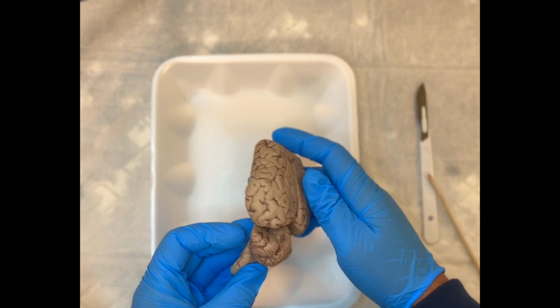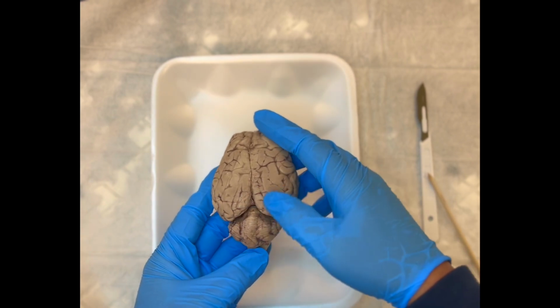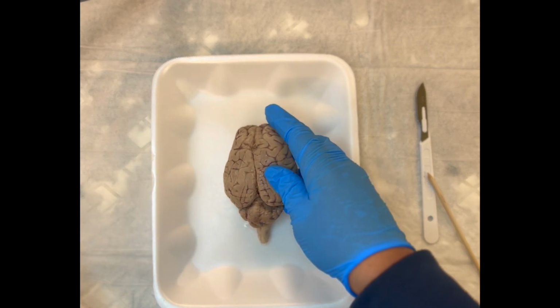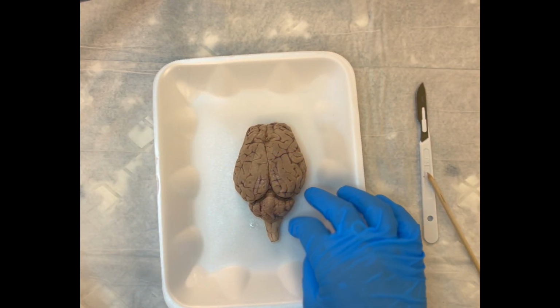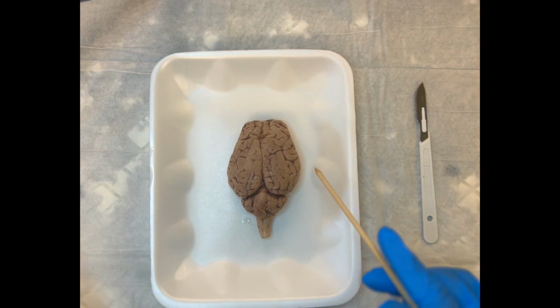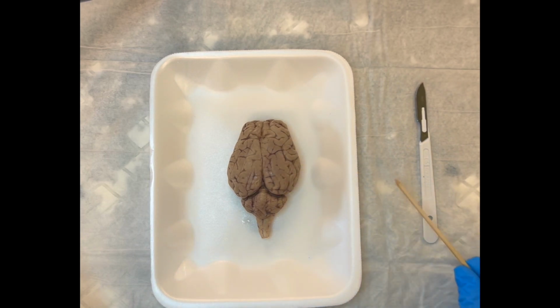They are connected due to the brainstem, but you'll see there is this transverse cerebral fissure here causing that separation, or transverse cerebellar fissure. Dividing the left and right cerebral hemispheres is this deep median longitudinal fissure.